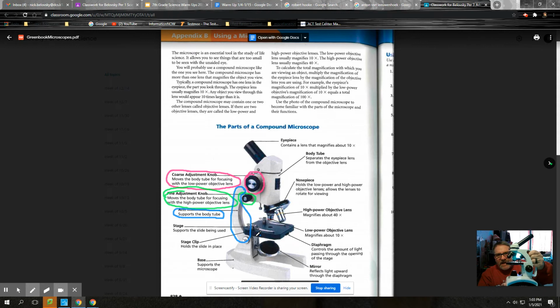On the screen, here are the two knobs. Here, the two knobs are one piece right here, and it's on the other side as well. So the arm looks different. It's got a handle in it. Let me move the pictures around so that I can show you a little better what I want you to see.